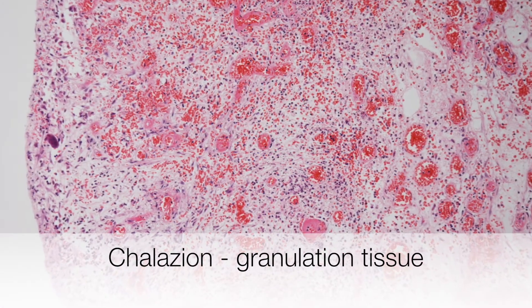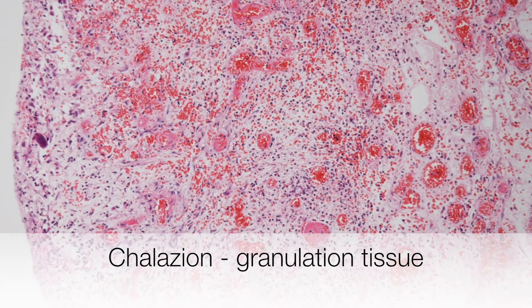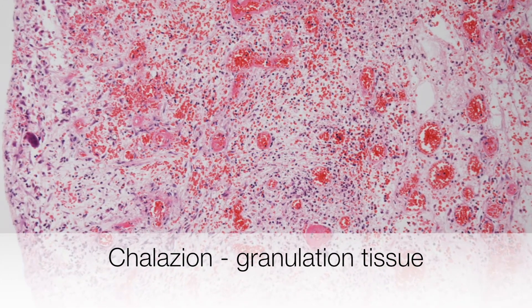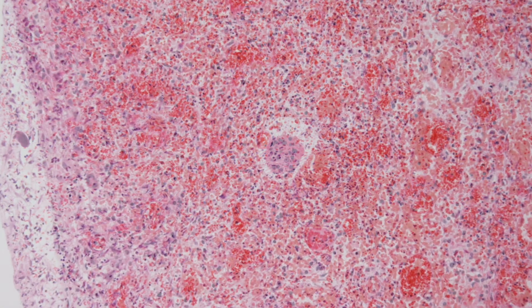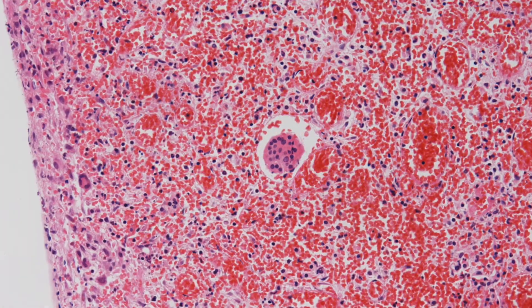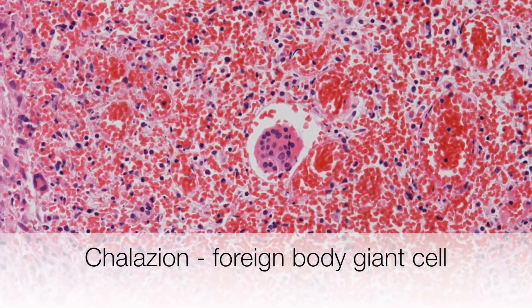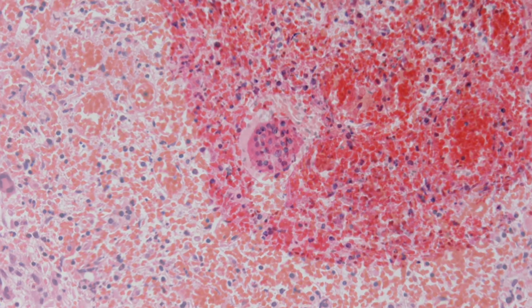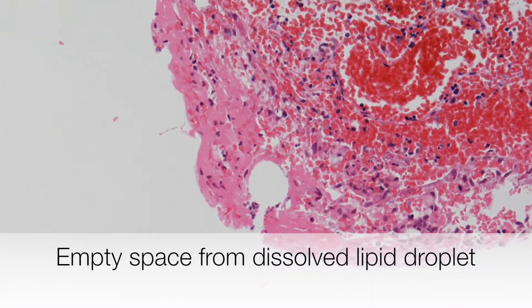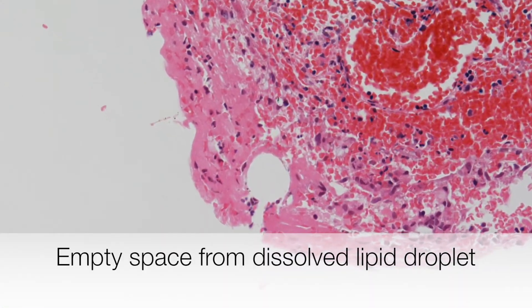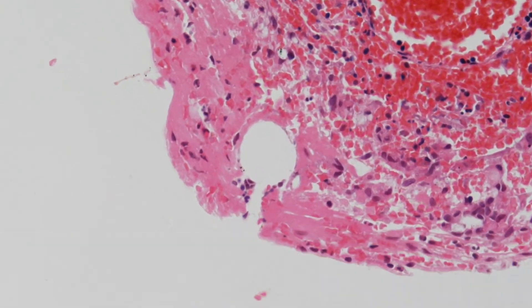This is a biopsy from a chalazion, and here the lesion is composed predominantly of inflamed granulation tissue. Here is a higher power with a foreign body giant cell in the middle of the picture. And in this area there is an empty space where the lipid has been dissolved out.